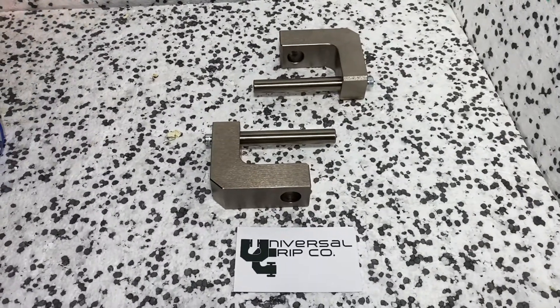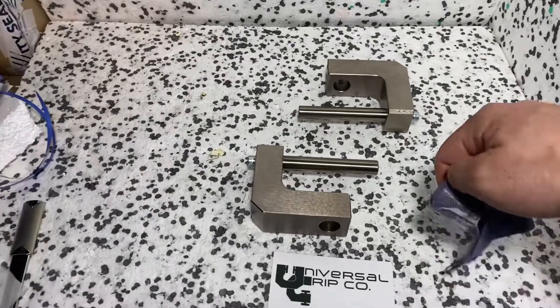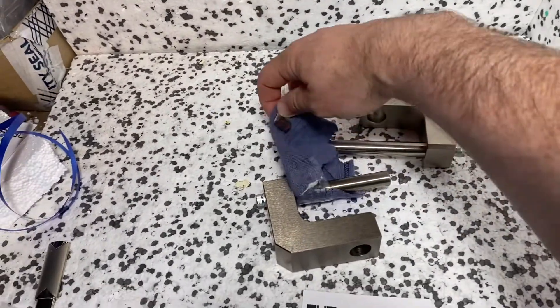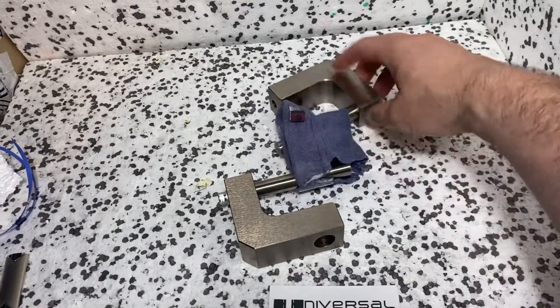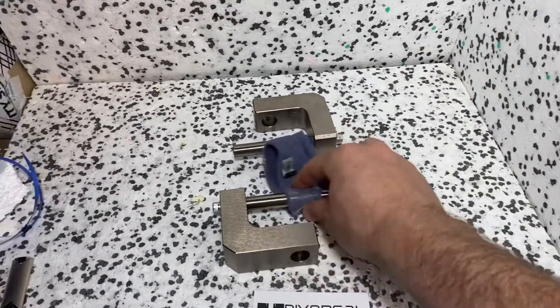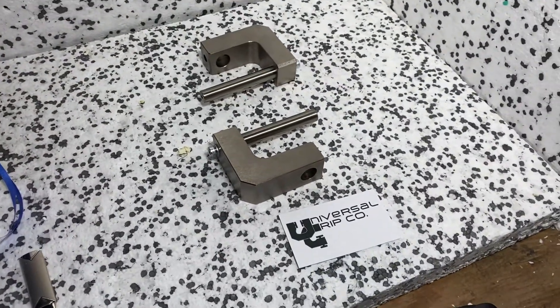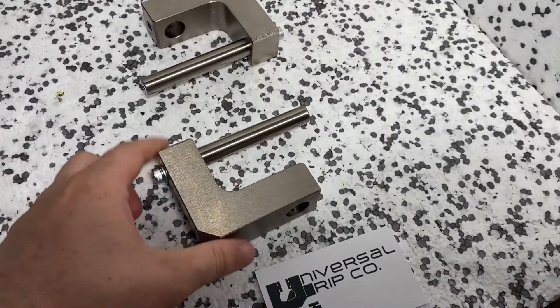The way this would test is you basically just loop the sample around here and then the other loop here — it looks kind of like that on the machine — and then you would pull that apart and measure the tensile force. Again, this is the ASTM D4964 fixture.